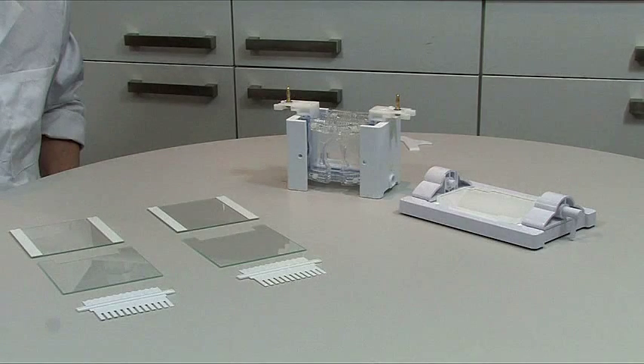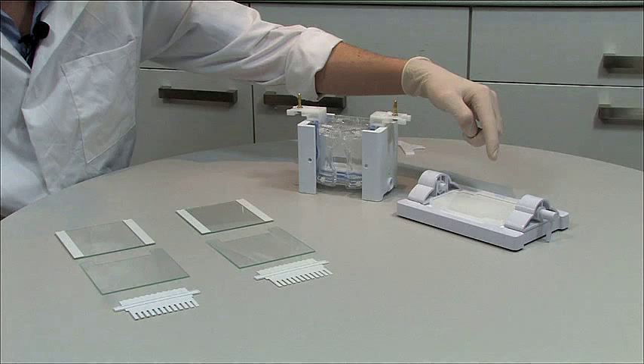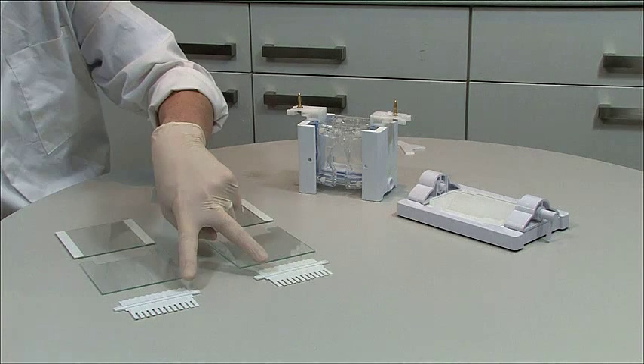This is what you will need: a gel casting and running upstand, casting base with mat, two plain glass plates with 1mm bonded spacers, two notched glass plates, and two 1mm 12-sample combs.